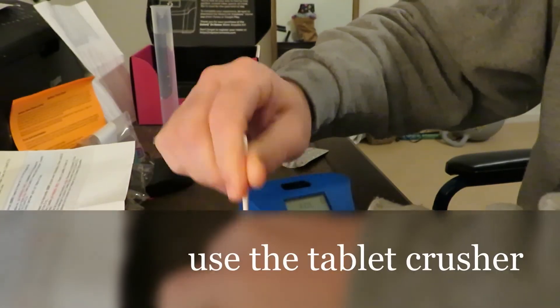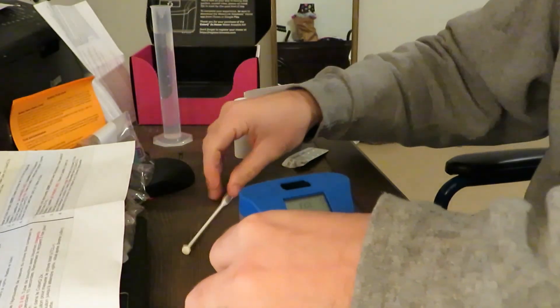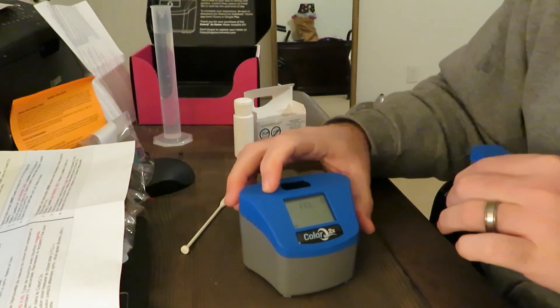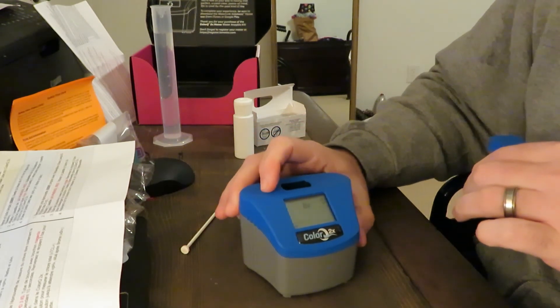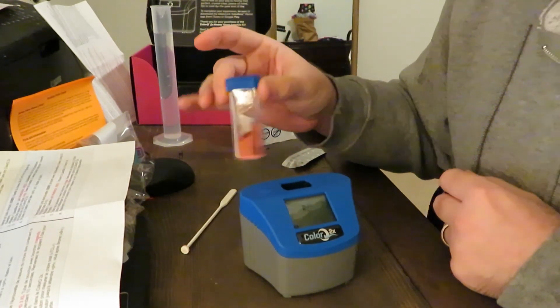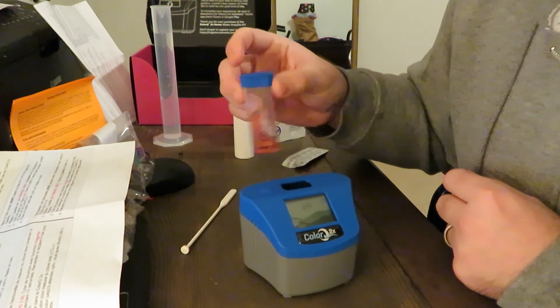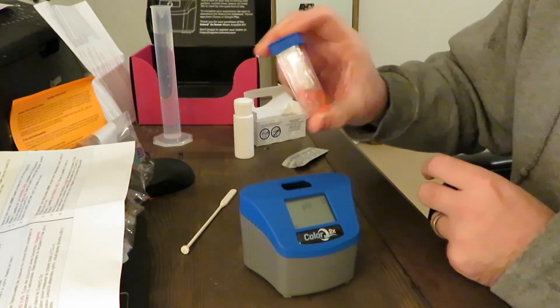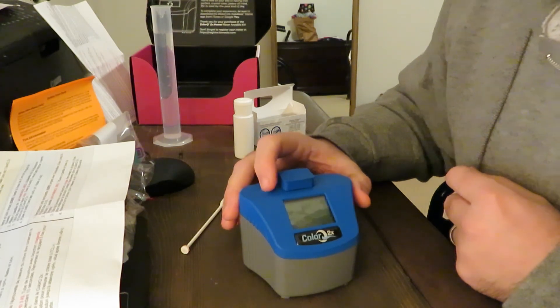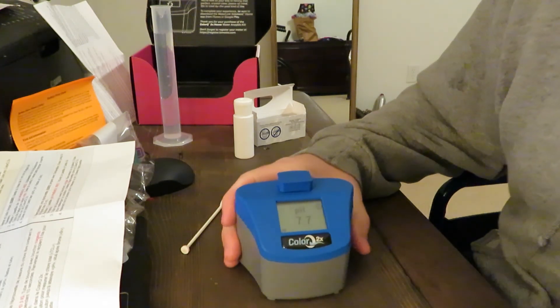You'll want to crush it up, then put the cap on. Right now I have it set for free chlorine, so I'm going to switch it over to pH. I've got it on, nice and mixed up — phenol red is always the reagent we use for pH. Invert it and put it in. It says invert it three times. We're going to put this in, press the button one more time, and it is going to give us a reading.